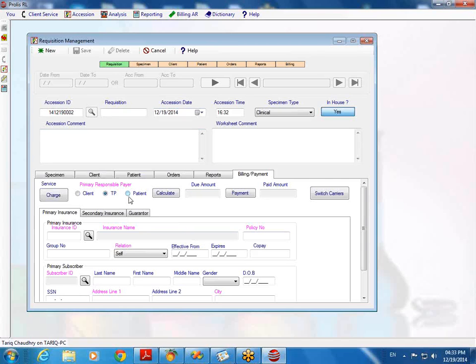And so this is something that you can enter while you're accessioning as well, right? You could enter it while you're accessioning, or you could do the accessioning today and enter the billing information tomorrow. Okay. And I see that you have that in-house button about yes or no. So, for example, is it possible to do kind of like a pre-accessioning where you're entering all the patient information and insurance information first, and then when the sample actually comes in, do the actual accessioning?